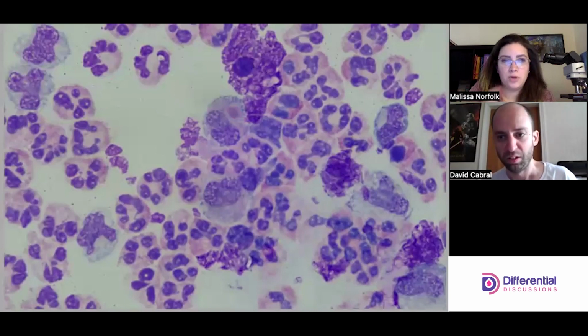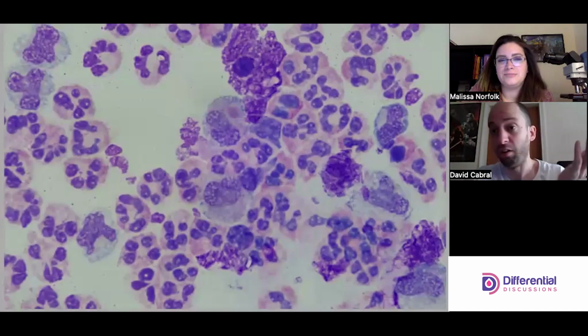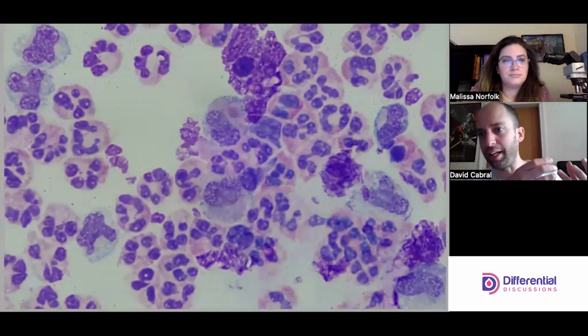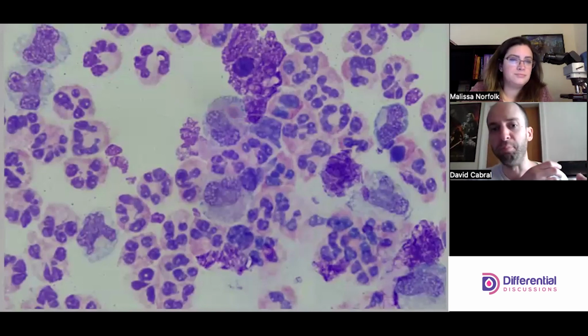Well, and we're looking for crystals when there's this many neutrophils. My hope was that there's crystals and we might happen upon it, and it might happen organically. Common in joint pathology, we've all heard of someone having something called gout. We can have a buildup of chemicals that are supersaturated, so they precipitate and form crystals. Crystals inside joints hurt really bad.